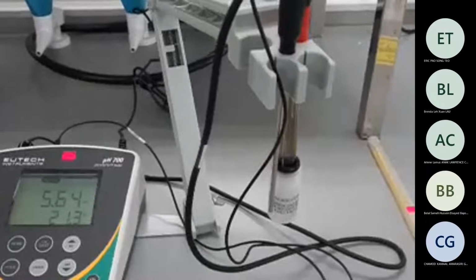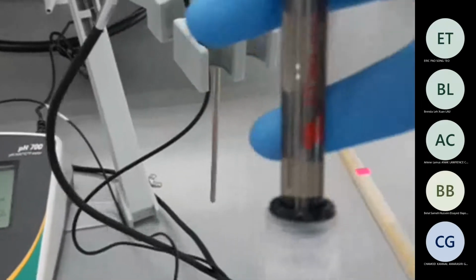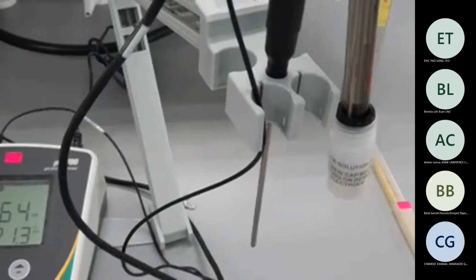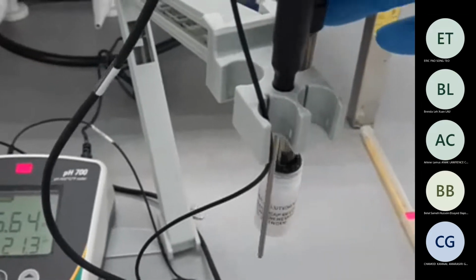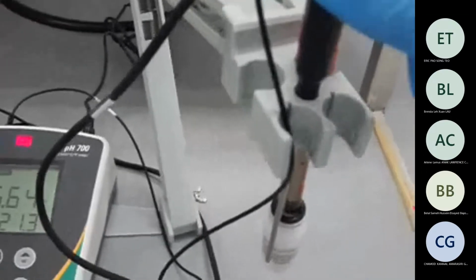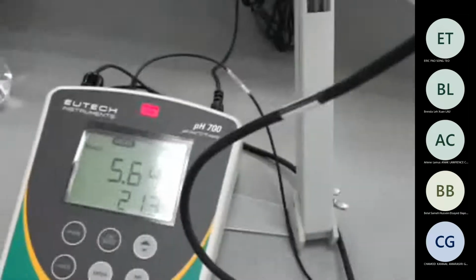What is important is this probe. This is the pH probe, and the liquid inside the small bottle is actually the buffer. So do not throw it away, and please be very careful in handling because the probe inside is very, very sensitive. And what is your beaker? The beaker that you just washed? Okay.